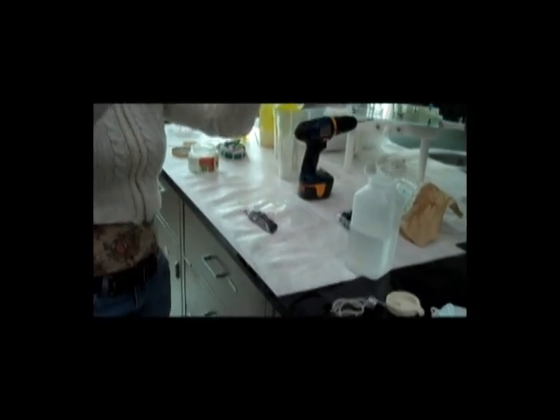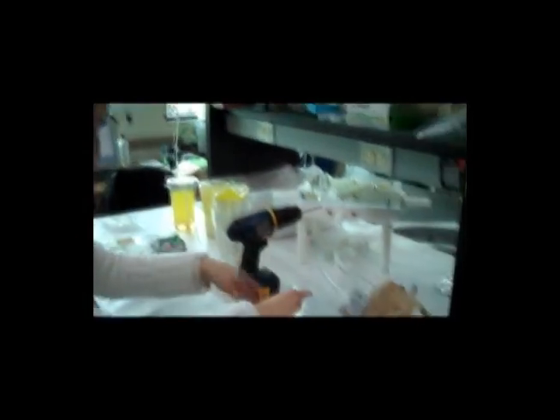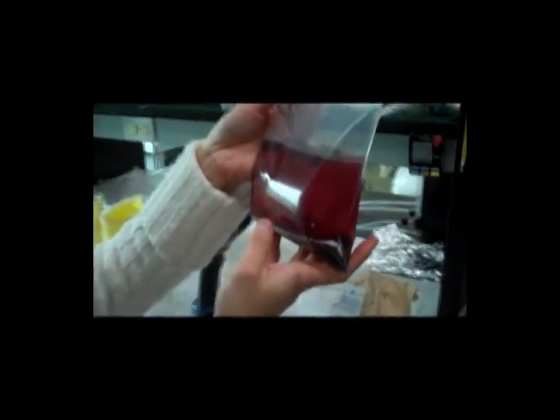Most of the berries should sink, and then the larvae should float. Here's a nice example of floating larvae and some pupae. Some of the larvae are swimming about in the solution, and some are coming to the top now.